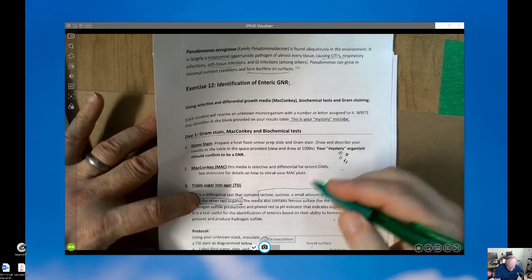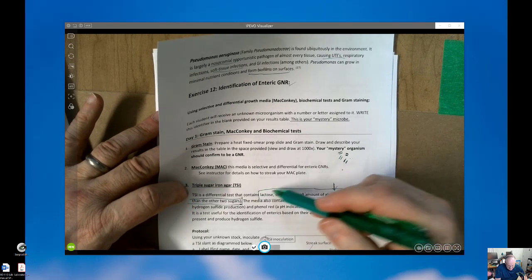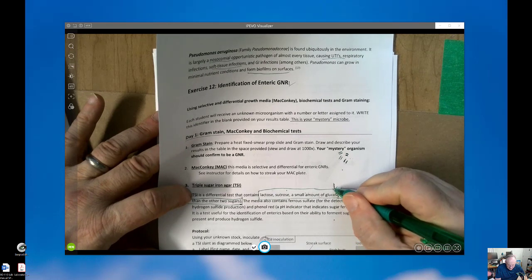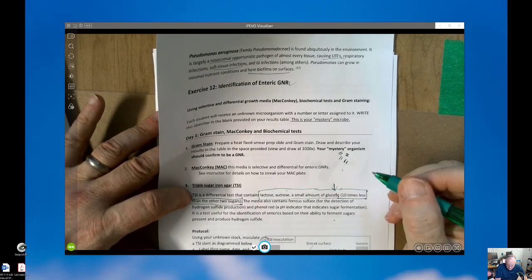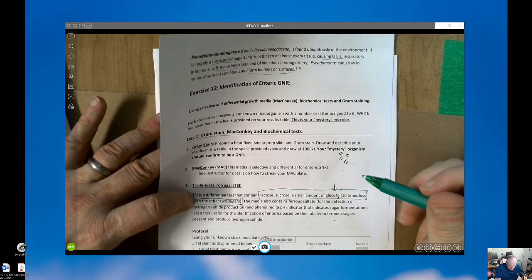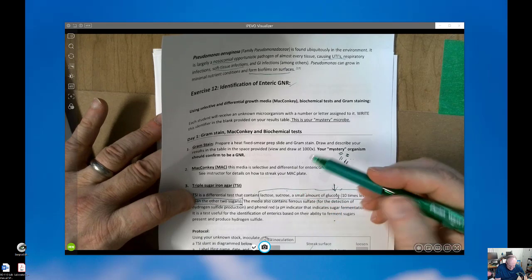The idea is that some of the microorganisms we test in TSI can't use some of these sugars, and for the ones that can use glucose, which is the most common one, we use 10 times less, and it gives us a characteristic when they grow showing which one is using the glucose. So we'll show you that.